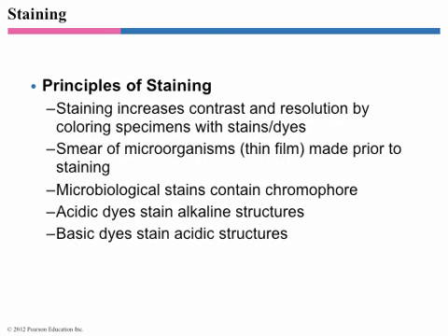So the first step to most staining procedures is you have to get a thin film of the bacteria. That is usually made, if you're just taking bacteria from a lab setting, by diluting it a little bit in water and letting it dry. This is a smear. Most of you have probably done smears at this point.